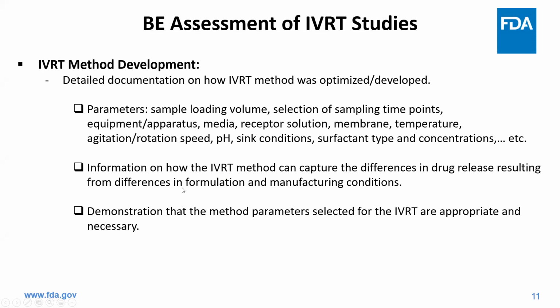And we would like to have information about how the IVRT can capture the differences in the drug release resulting from differences in the formulation and manufacturing conditions. Overall, we would like the applicant to demonstrate that the method parameters selected for the IVRT study are appropriate and necessary.